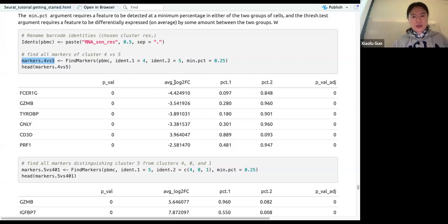And then for this one, I'm not sure how it was calculated. If we use statistics to calculate that, we can calculate the effect size. One way of doing that is bootstrapping, or if you already know the underlying true distribution, you can use the true distribution.